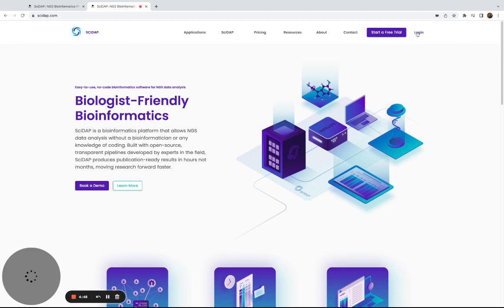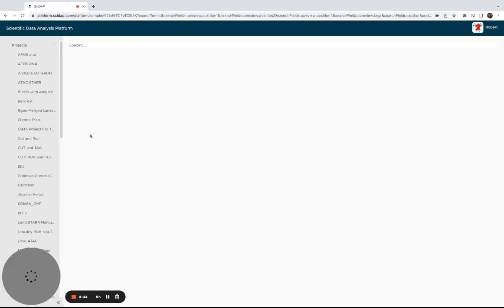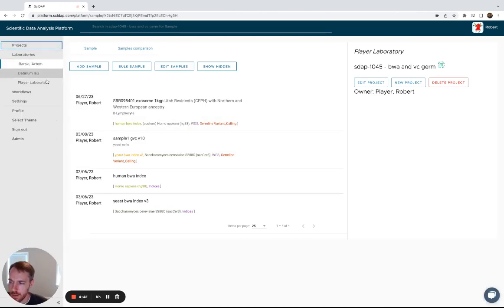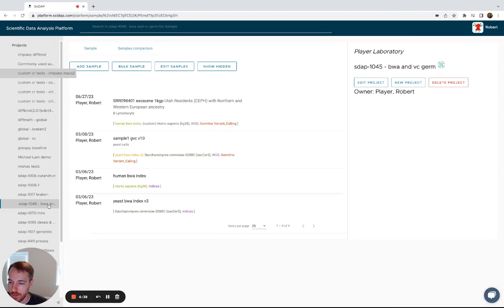First you'll log into your SciDapp account, find the laboratory where you want to make your project or that your project already exists.